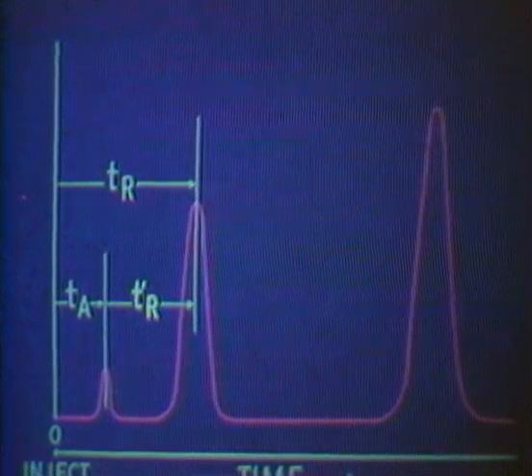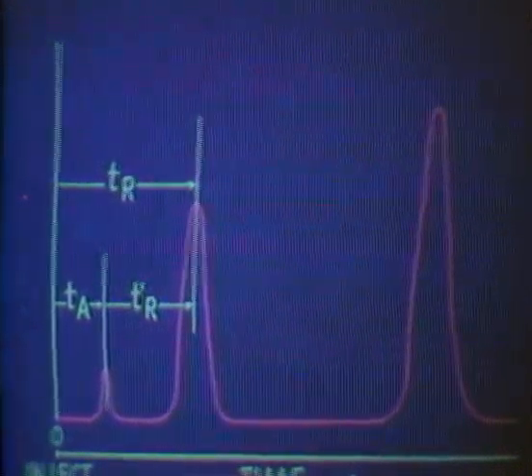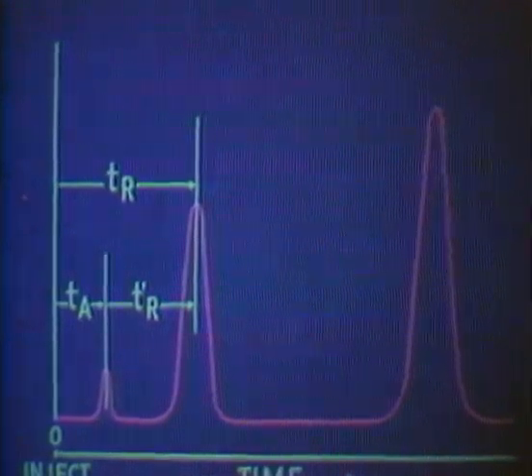The retention time is reproducible if the same column is used, together with the same flow rate and column temperature. However, relative retention times must be used for identification when samples are analyzed in different laboratories, because columns and conditions are almost never the same.